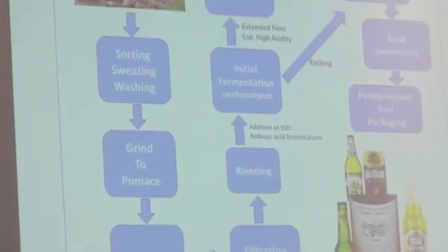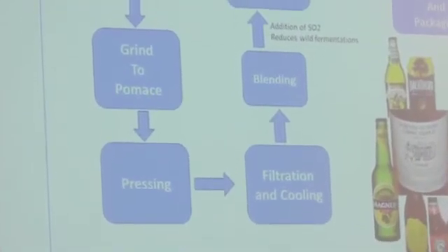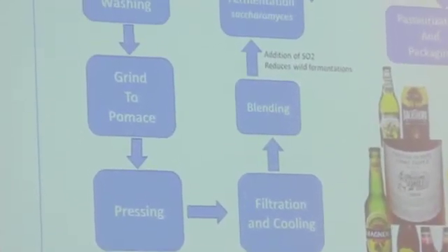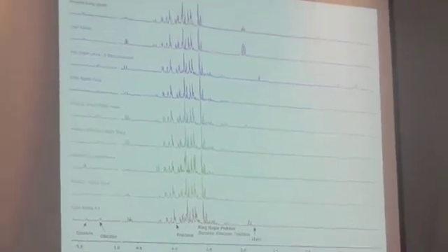So I've got an example of something I just did with William Grote, who's a very serious hobbyist right now, but we did a nice little project together. So this is what apple juice is. I want you guys all to leave, and you'll actually know how to read an NMR spectrum when you leave. You'll be like, oh. So again, like I said, it's always in the same place.